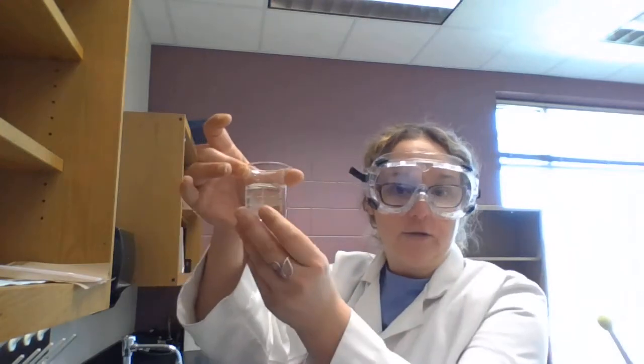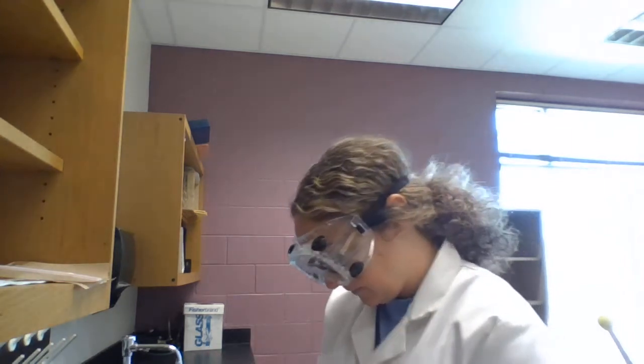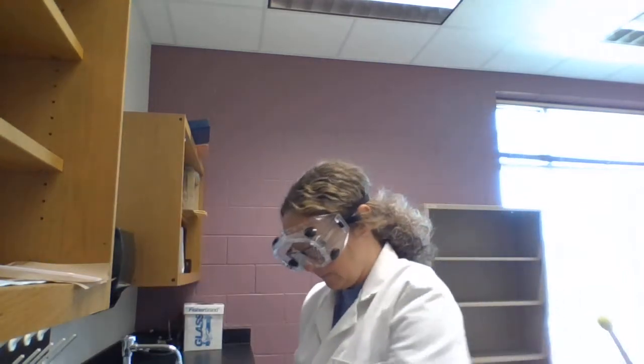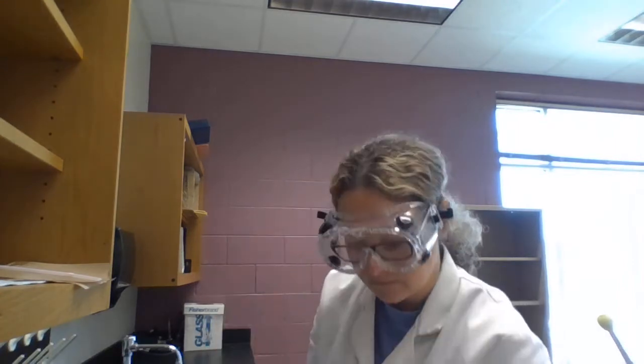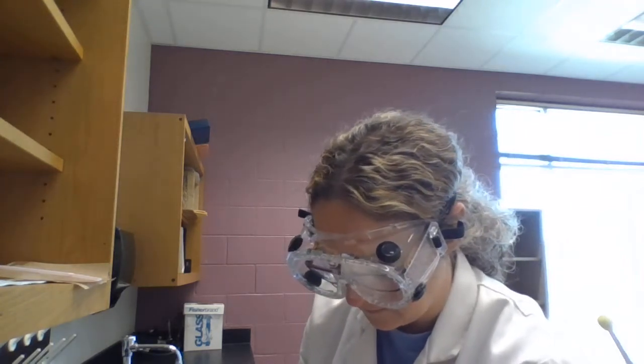All right, so we've been asked to add water to a beaker, and I've got a little too much water. So I'll dump some out. And then we're going to add some bromothymol blue. All right, and it says what color is it? Okay. So we're going to look for the color here.